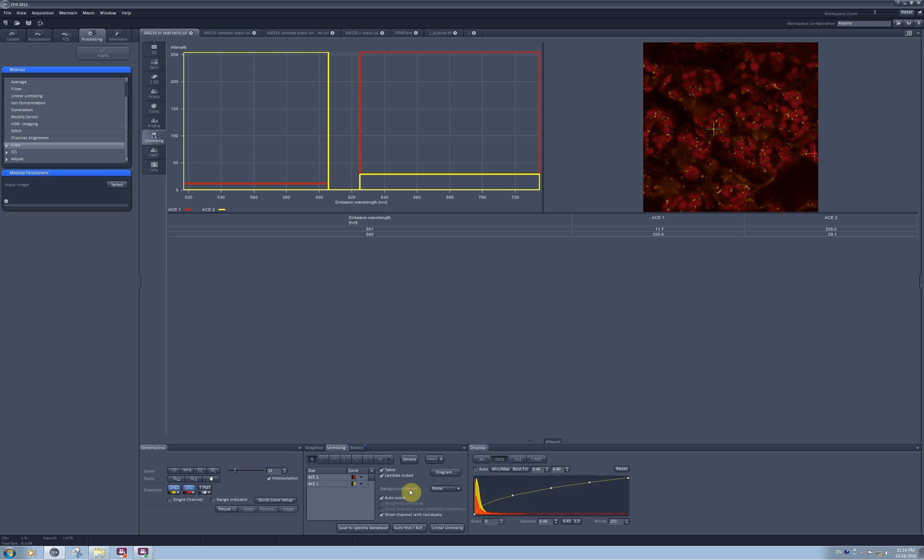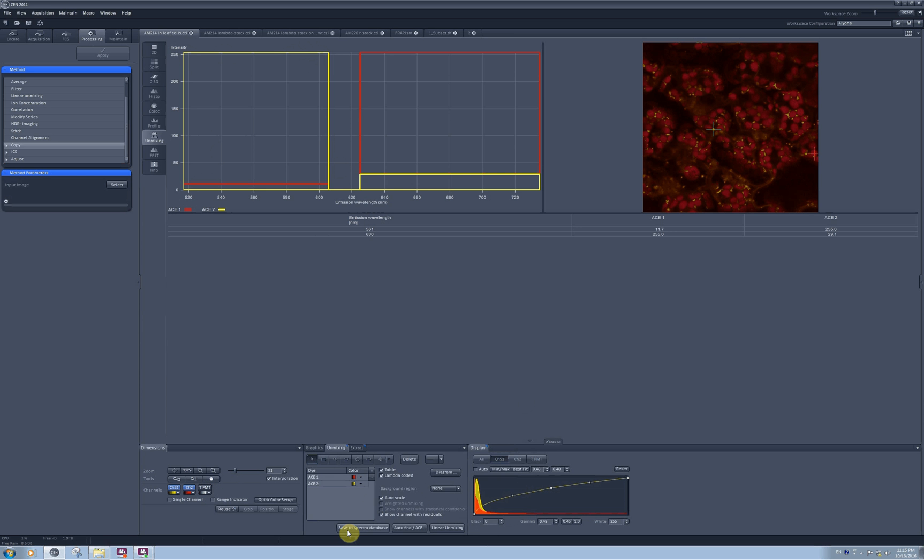If you would like to remove the chlorophyll from your image completely, you can just assign it as a background and it will be removed. Auto scale automatically scales intensities and channels you want to unmix to comparable values. And there is an option here to show channel with residuals with the pixels which are not unmixed. Since I'm not including TPMT into the linear mixing, the whole TPMT intensities will go to the residuals.